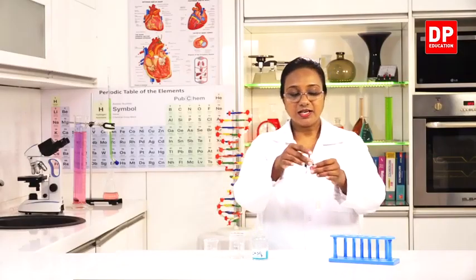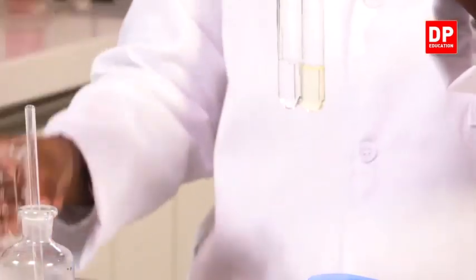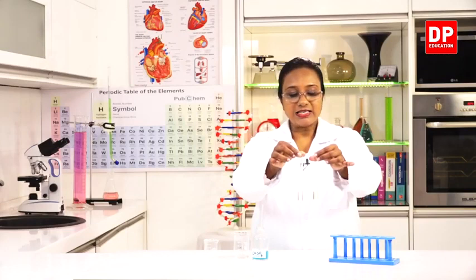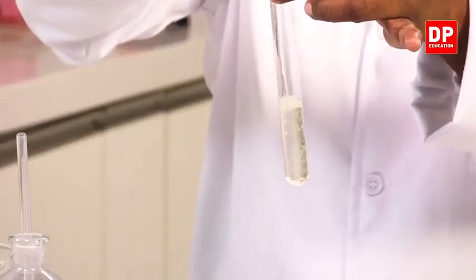Now I will take another test tube and into it the same volume of sodium hydroxide, or slightly excess volume of sodium hydroxide has to be taken. Here you can see students, it's almost the same volume, if at all a slightly excess amount of sodium hydroxide. Now I will transfer the sodium hydroxide into the egg white.